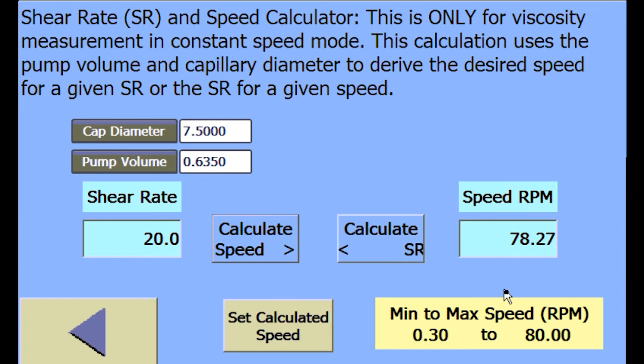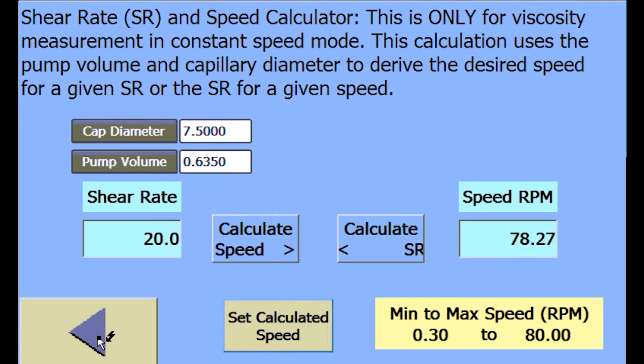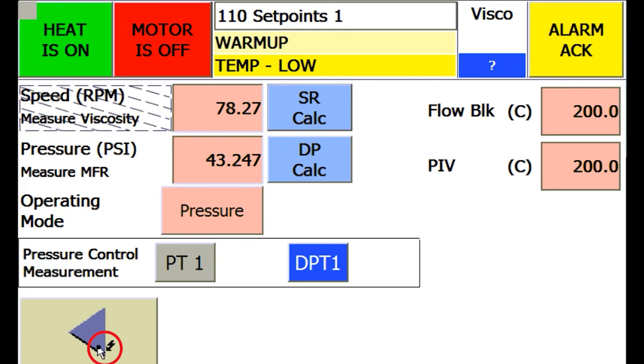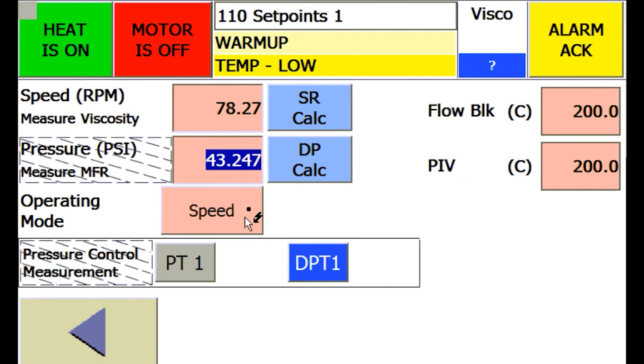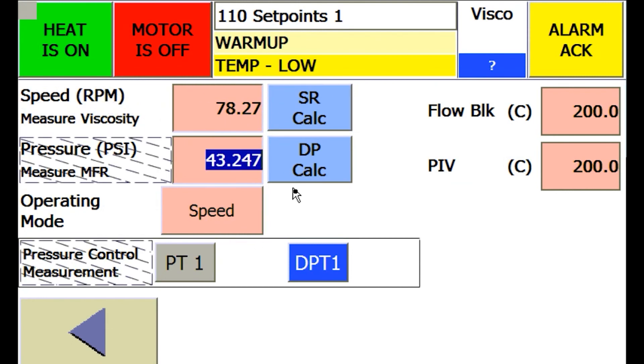To set the speed shown here as your actual system set point, simply press the set calculated speed button. If you go back to the set point screen, you'll see now that is the speed setting. If I switch the control operating mode to speed, then the system will now run to this set point when one presses the motor button.